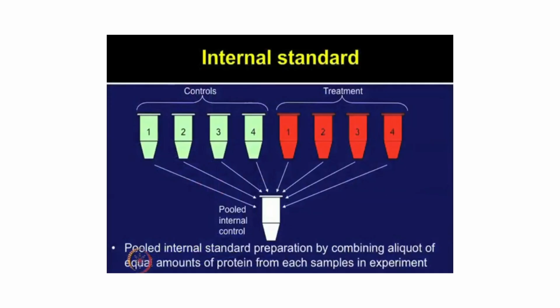Generally, having an internal standard is important while doing any type of proteomics or mass spec analysis. So what is an internal standard all about? In terms of mass spec, an internal standard can be any specific compound which will test whether your method of LCMS or GCMS mass spectrometry is working fine or not. Basically it's a calibration step, to check whether your instrument is running smoothly, because that internal standard should give you the same results every time you run your samples. Or else the internal standard can be the other way around, by pooling all your samples.